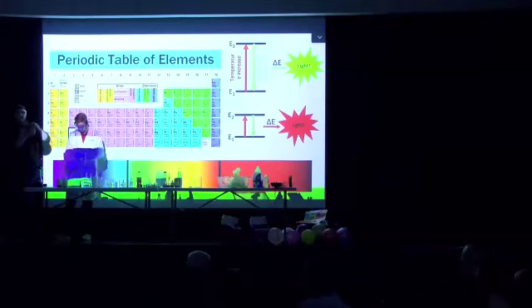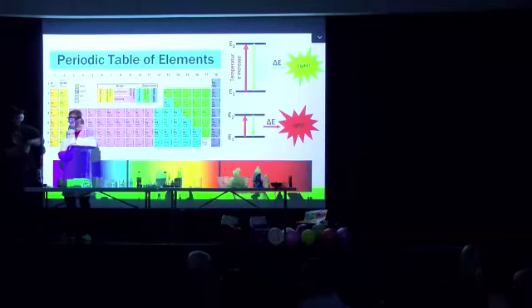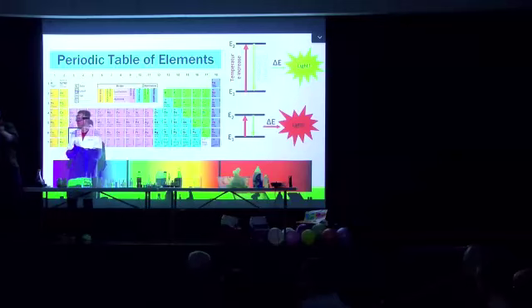All right, up next we have lithium. It's gonna be another red color. You guys see it?